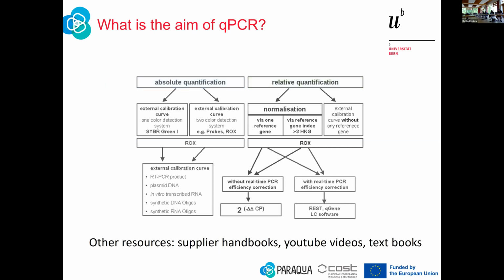And if you feel like this is daunting or you want to get more, a very good source are often supplier handbooks. They really take good care to explain to you how their products work. And there are awesome YouTube videos on qPCR. So Googling is good in this case.